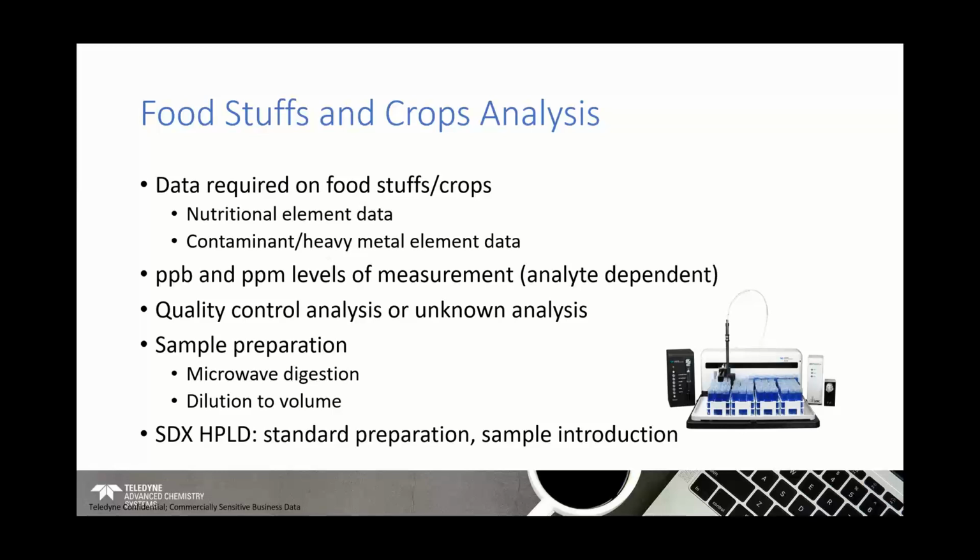For this kind of analysis, like most kinds of analysis, you might be looking at this from a quality control point of view. So you might have a good understanding already of the level of concentration of analytes in your sample, and from a quality control point of view, you might be looking at just confirming whether or not you are above or below by a certain magnitude of concentration for your analytes.